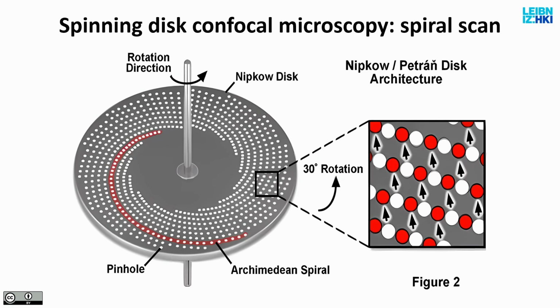The camera shutter just has to stay open long enough to collect a signal from every illuminated point to cover the entire sample. But for a point scanning confocal, this would mean several seconds until the laser beam goes through. Here it takes like 30 milliseconds because you have so many pinholes. So you use a camera that has disadvantages. The sensitivity is not as good as for the photomultiplier. But you do get much, much faster image collection.